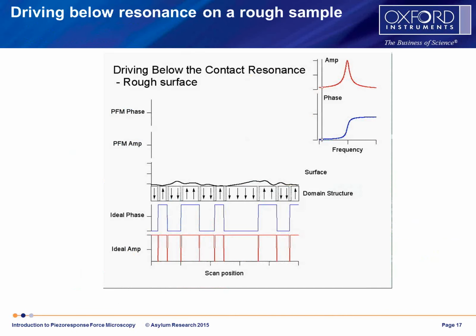Okay, to explore this a little bit more completely, we made a little movie where we have a theoretical response of a PFM cantilever over a sample. This sample has down domains, up domains, down domains, and so on that have different spacing. We've also built into this model some surface roughness. The surface roughness changes the contact area between the tip and the sample in such a way that it changes the stiffness of that contact. And then, of course, when you change the stiffness, that makes the resonant frequency move up and down.